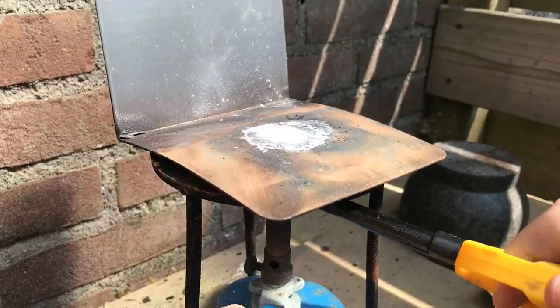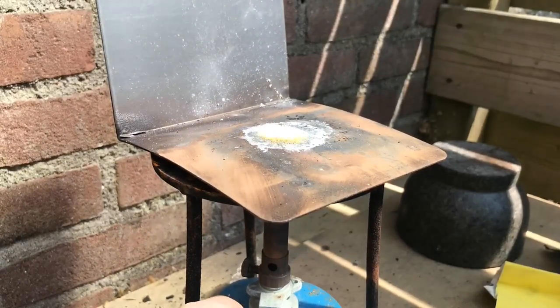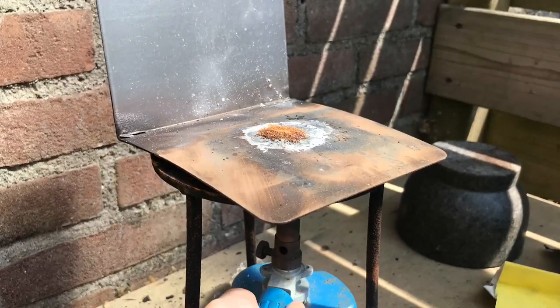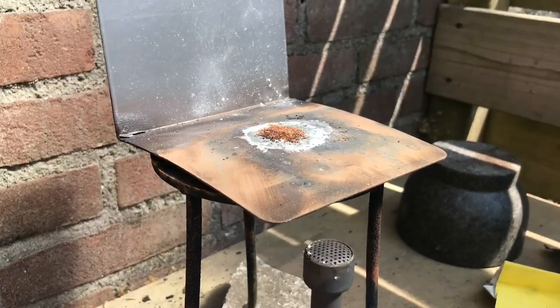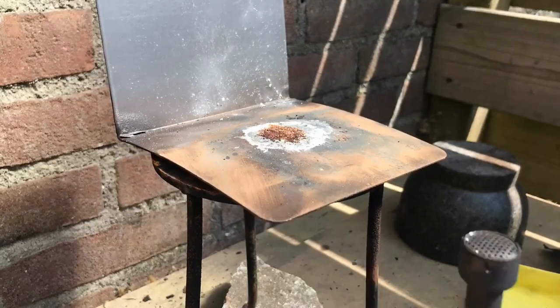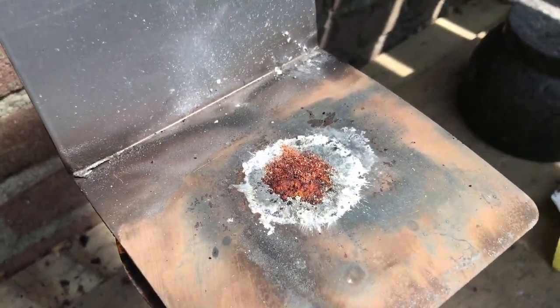So I put a little bit of my yellow powder on the plate and turn on the fire beneath it, and very nervously wait until it turns black and starts to boil a little and give off a little bit of smoke, and then quickly turn off the fire before it explodes in my face. Okay, so now we have this. It should be very flammable.